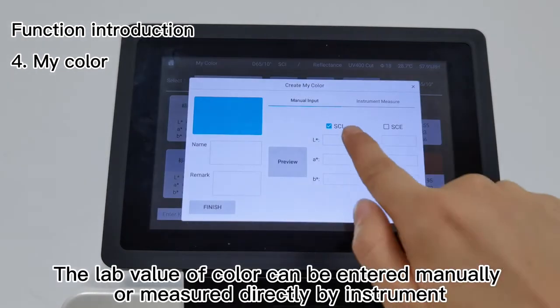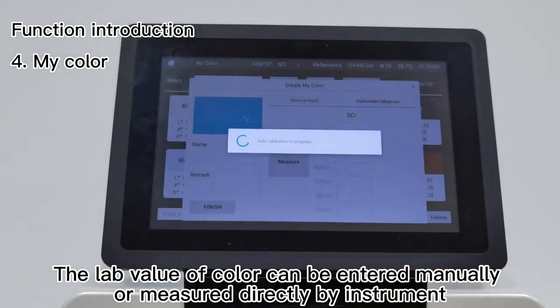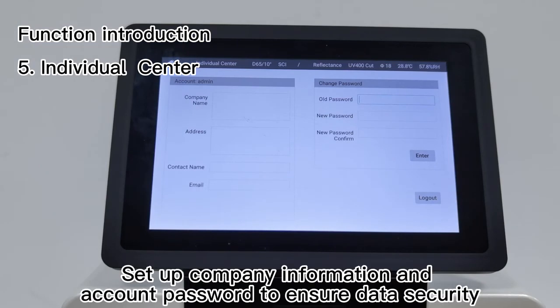Module 5 - Individual Center: Set up company information and account password to ensure data security.